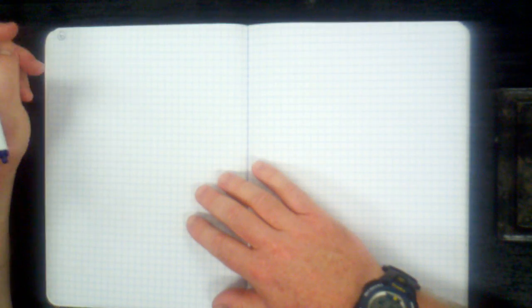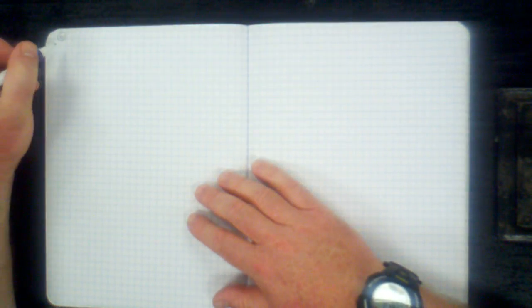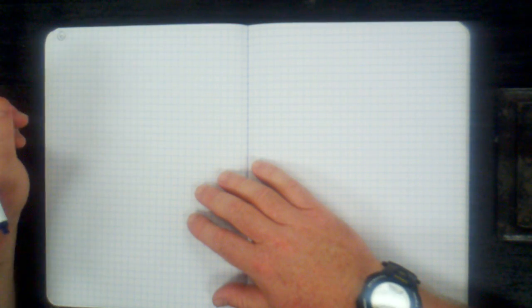Now that took me 34 seconds to do. So if I were to do that 10 more times, it would take 5 minutes. Now, this book has 200 pages in it, so it would take me about 10 minutes to finish this book. I could even do it while I was watching television. So, I'm not going to make you sit through that, but I'm just going to go ahead and do it on my own. So, that's how you start your notebook.